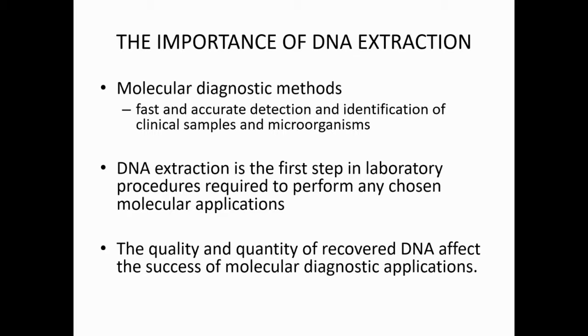And so in DNA extraction, we need to get a high yield and high quality DNA from any sample that we collect. Of course, the DNA quality and quantity depend on the technical requirement, time efficiency, and also cost effectiveness. All these are under consideration, and so we can choose a particular technique to extract the DNA.